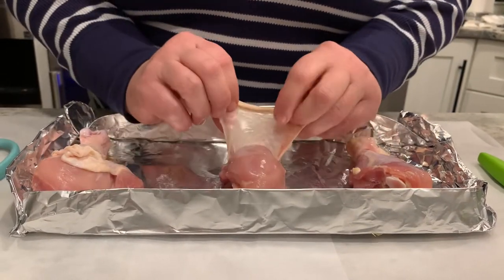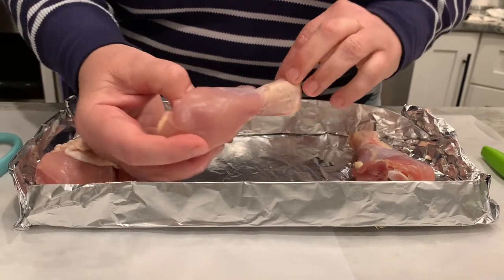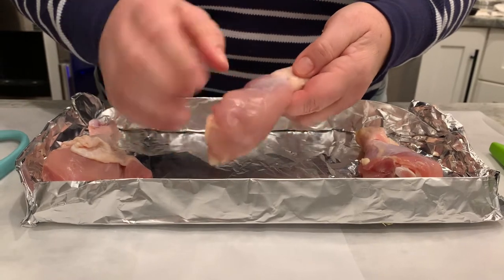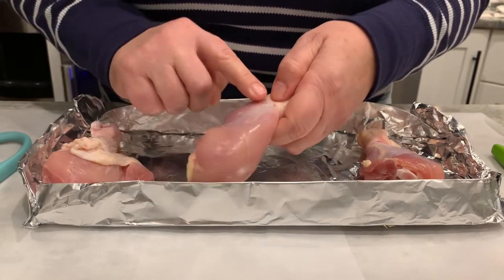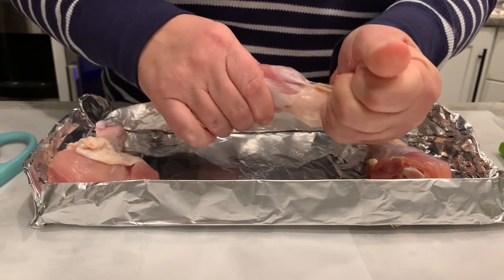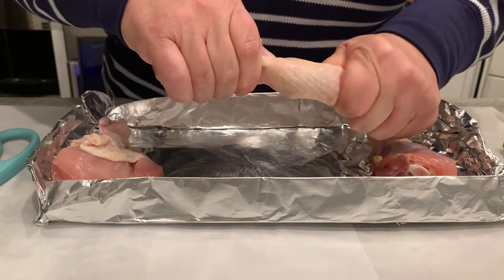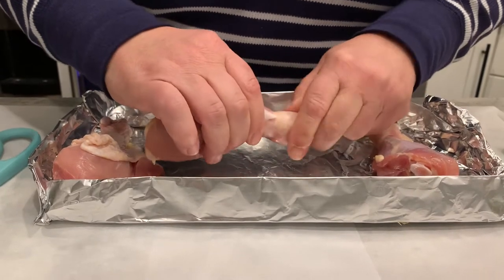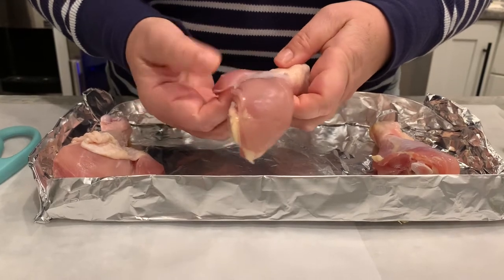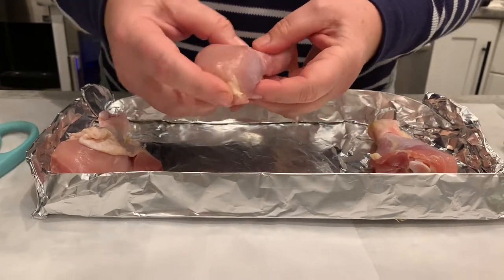Pulling the skin back, we saw the epidermis and the subcutaneous layer. The next connective tissue we'll look at is the tendon — see that white tissue there? It's connecting to the bone at the distal end. And this is the muscle tissue — this is dark meat.